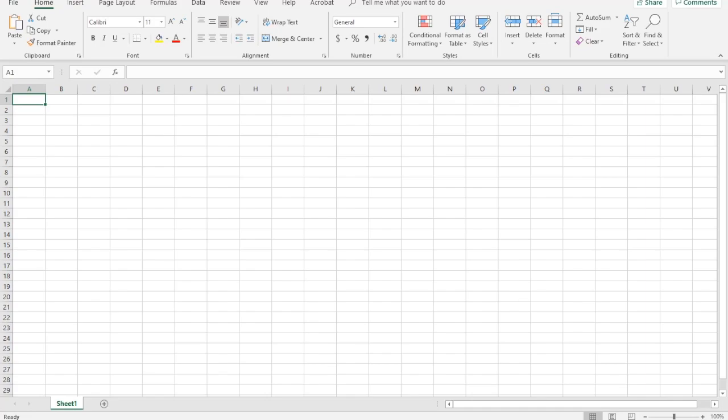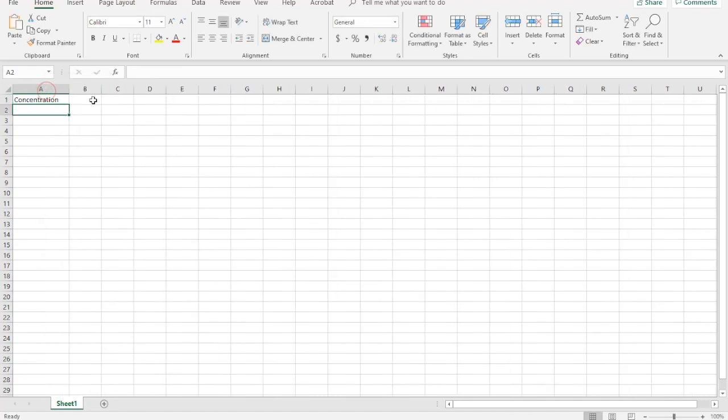Alright, hello everyone. So we're going to have a brief little tutorial on how to plot your data in Excel. So the first thing we want to do is put in our data. So we're going to have our concentration and our absorbance.